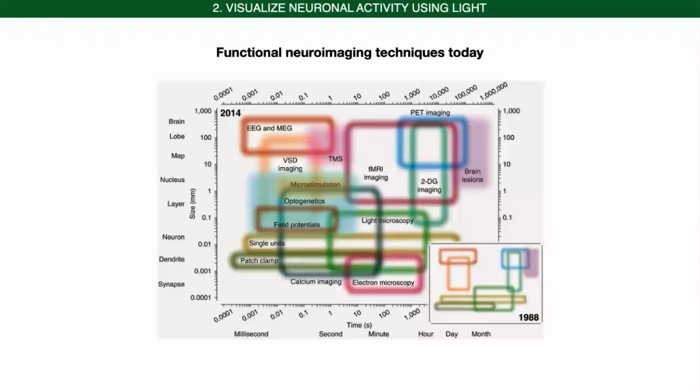So neuronal activity is not as precise as with an electrode, the electrical field that you can study using electrophysiology, as we will see. But indeed, it allows other advantages related to these techniques that we are also going to explore.